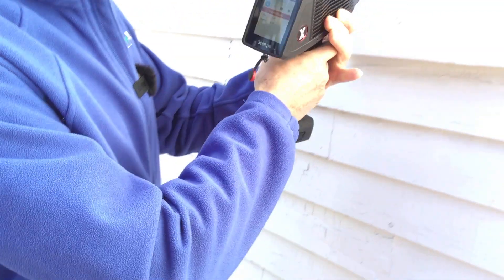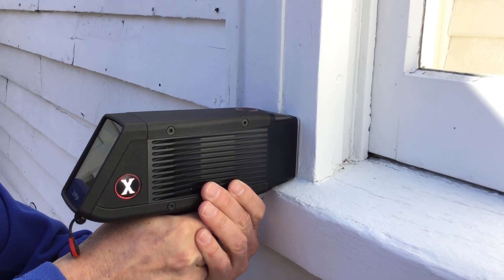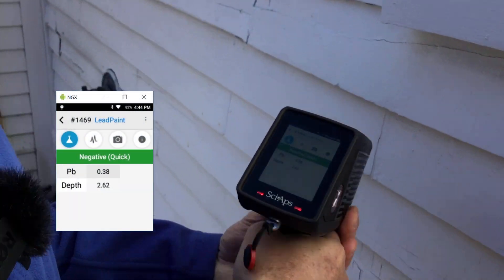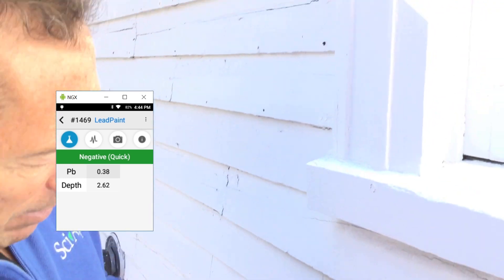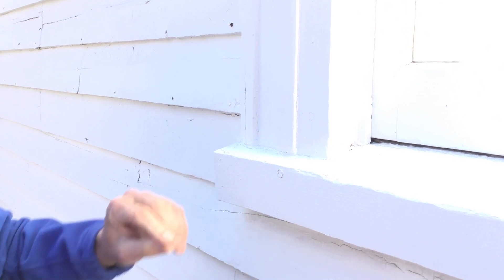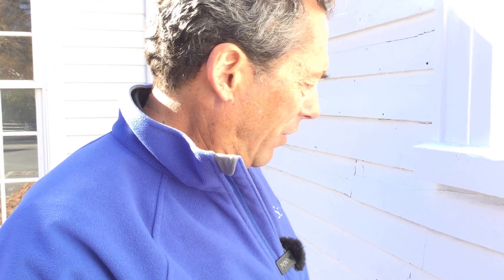Let's try this spot up here, some other paint. This is about a four-second test. This is test 1469. The lead here is a little lower — it's only about 0.4 — and it doesn't have nearly the depth. If you look here, you can see it looks like a little newer material, so there's less paint, and you can just visually see that. Those are kind of your longer tests because they're closer to the action level and they're in thick paint.